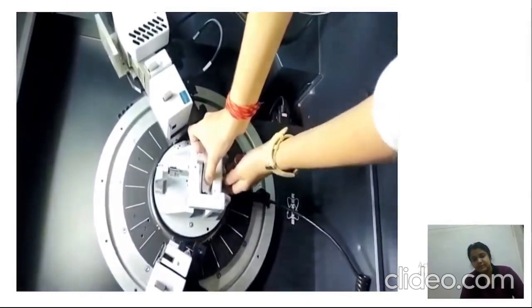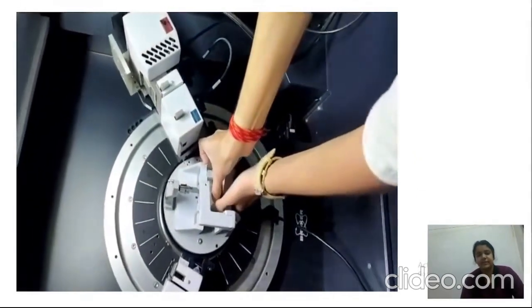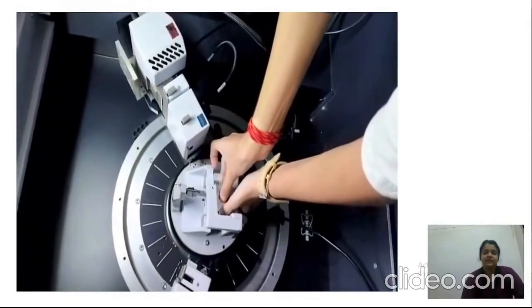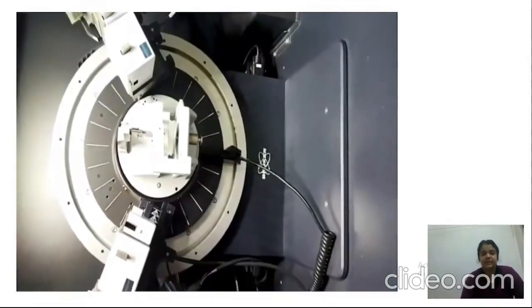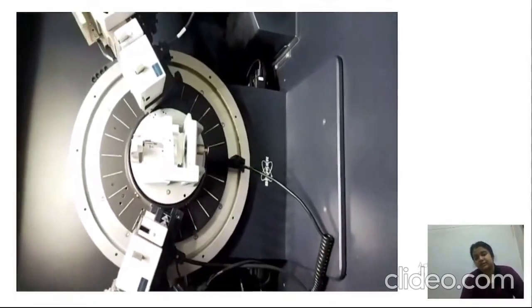In this manner it should be adjusted very properly, and then the diffractometer starts to record the data, and on the monitor we can get the X-ray diffraction pattern.